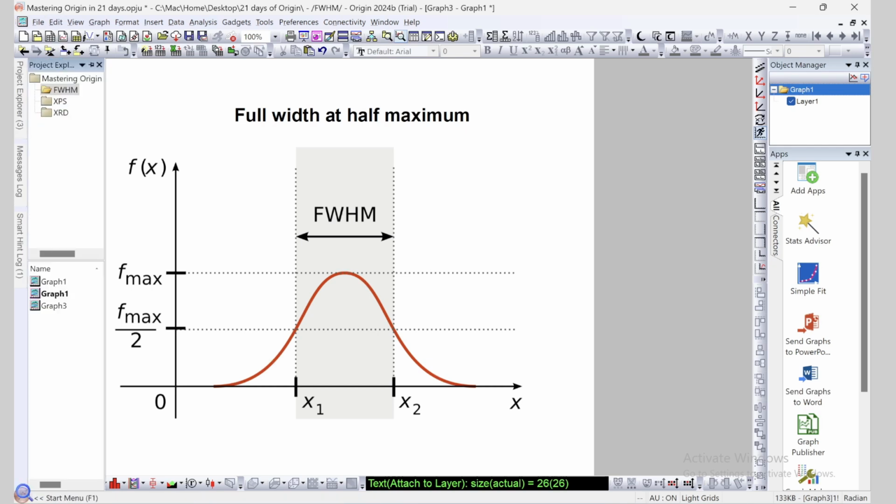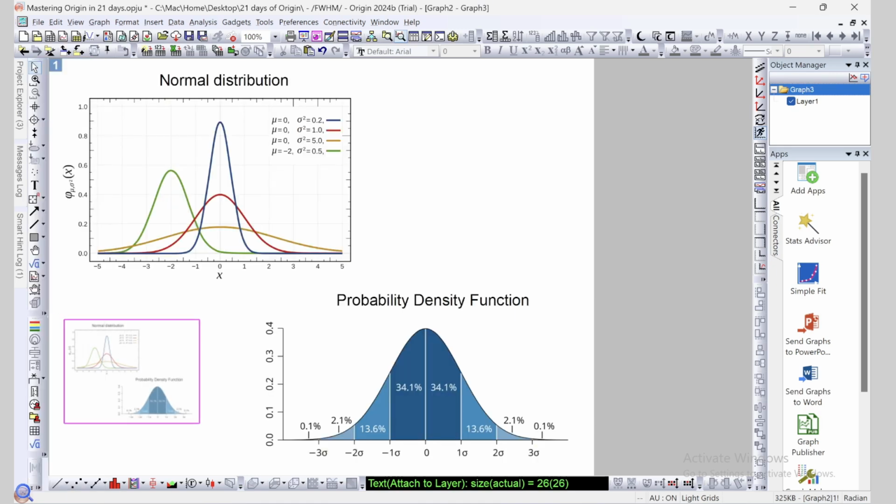Whenever we have a peak, in probability or in dynamics, there is the Gaussian distribution, which is called a normal distribution curve. This is a distribution of data points across your curve. What is the probability of finding the data point again in the curve when you do a second measurement is given by the graph below. There are symmetric as well as unsymmetric peaks, but in most probability, the peaks are symmetric in nature.